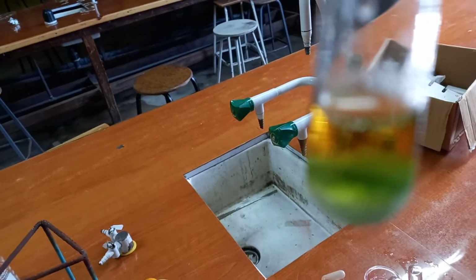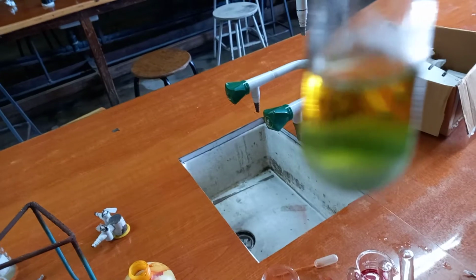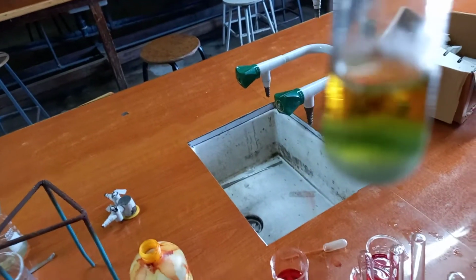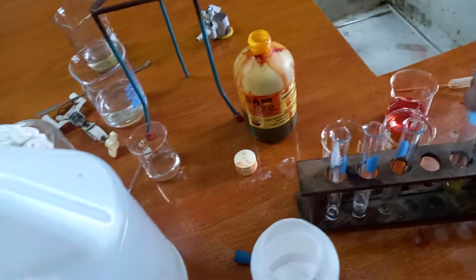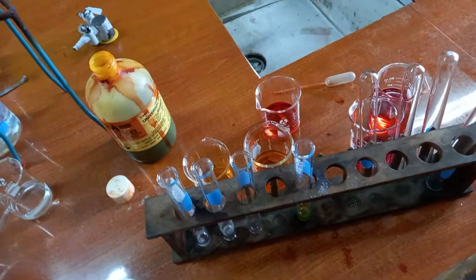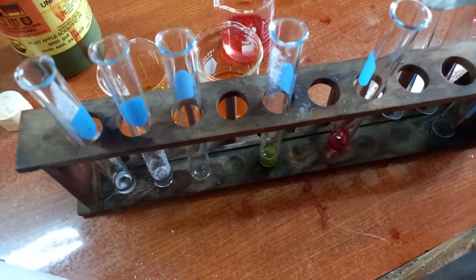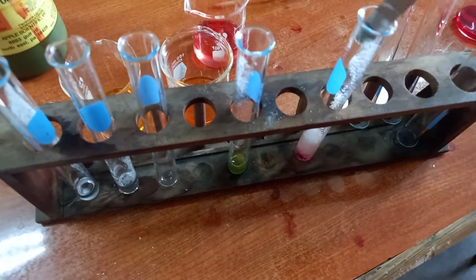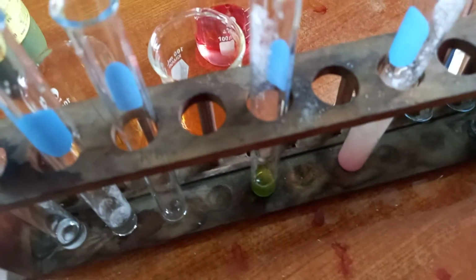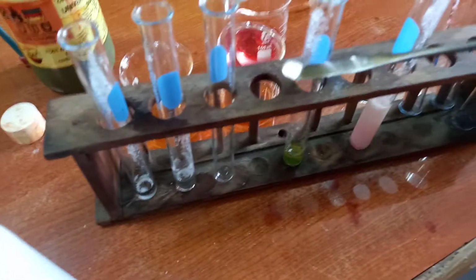So let's go now with the ethanoic acid and see how it reacts. Alright, so here is our sample, well, not the sample. This is actual ethanoic acid, right? And as you can see, definitely there is a difference. So you can see the difference in reactivity now, right?